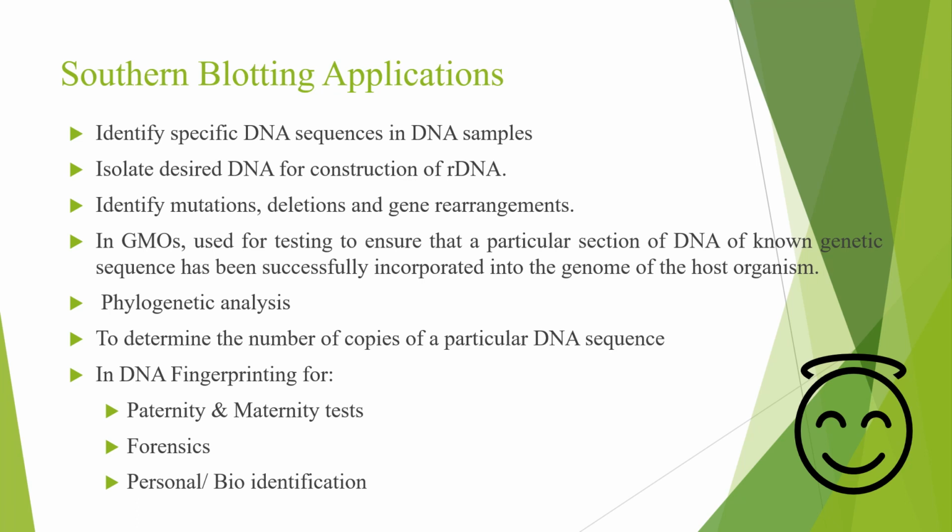Applications of Southern blotting. It's used to identify specific DNA sequences in a DNA sample. It is also used to isolate desired DNA for construction of rDNA. It is used to identify mutations, deletions and gene rearrangements.